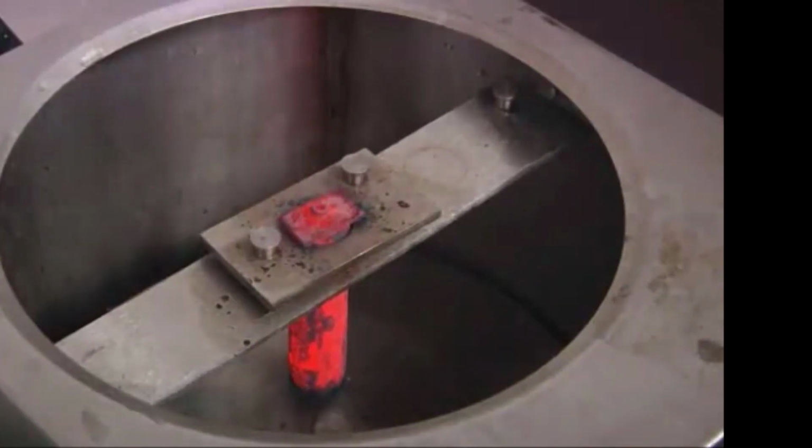You can see how the bottom of the bar almost immediately turns a dull gray brown, but the top of the bar is still glowing. And that very clearly illustrates the difference in the cooling rates from the bottom of the bar to the top of the bar. And as it cools, the top is glowing a more dull red color, and the brown is slowly spreading up along the length of the bar.